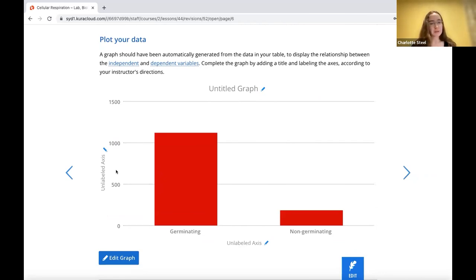This example data was very useful during the COVID-19 pandemic when teaching was disrupted and students couldn't attend class or come into labs on campus. But it's also very useful even if COVID is not a pressing issue on your campus in terms of class scheduling. You can use it if a student just misses a lab for any reason, and you can also use it if they've managed to mess up their experiment somehow and they're not seeing the data they need in order to perform the analysis and answer the questions. You can provide that data to them really easily in the lab.